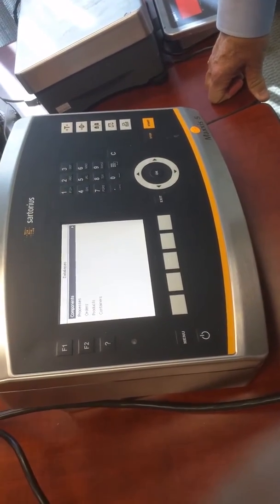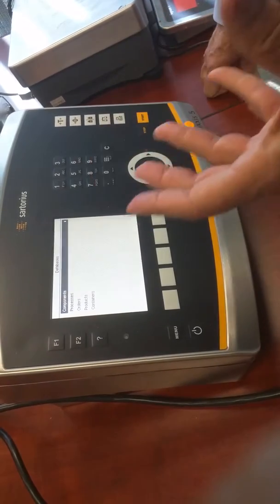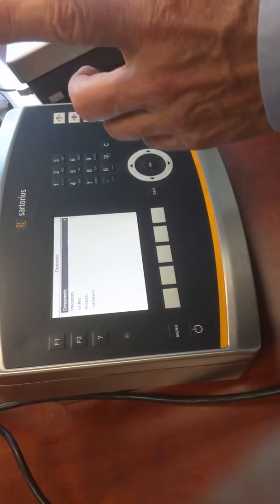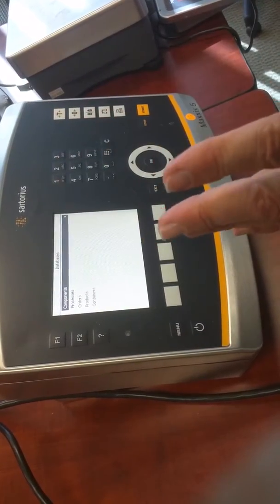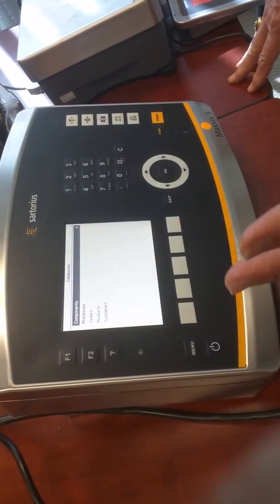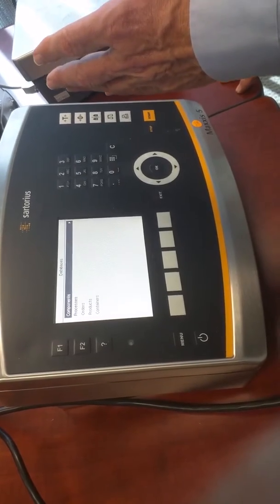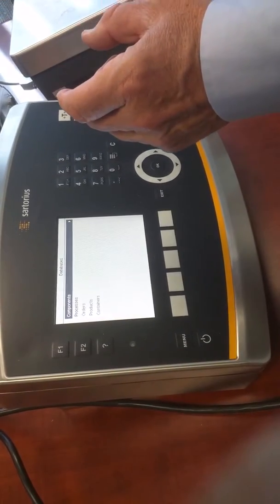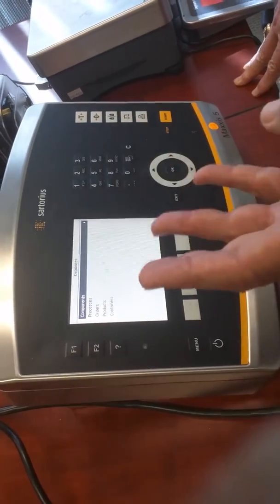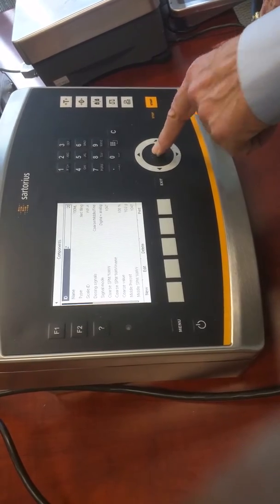So components tell you what are the components of one fill. How are you going to do that? Are you going to run it at 100% of pump speed for the whole time? Or are you going to run it at 100% for 90% of the time as its fastest, and then slow it down with a middle setting, and then slow it down again with a fine setting? So you'll have under components, so we'll hit OK.